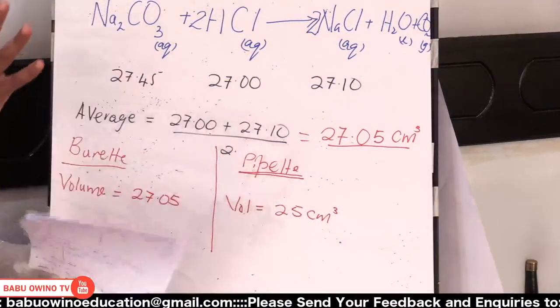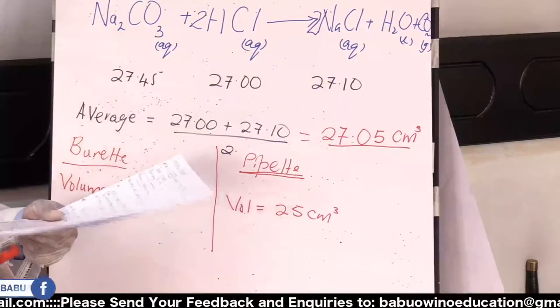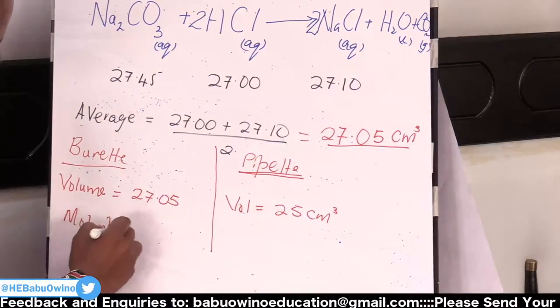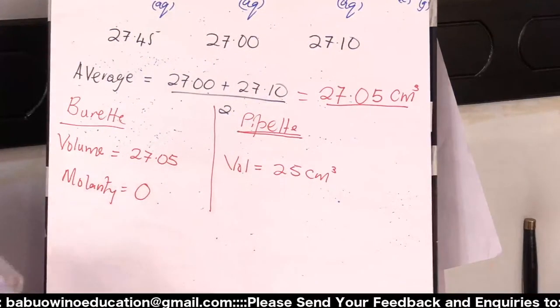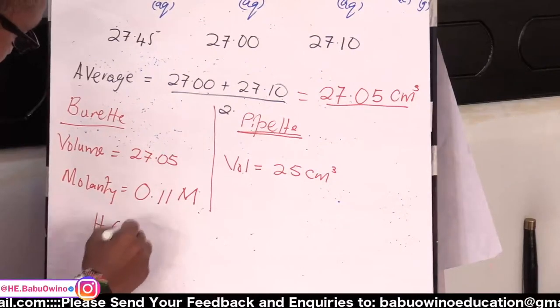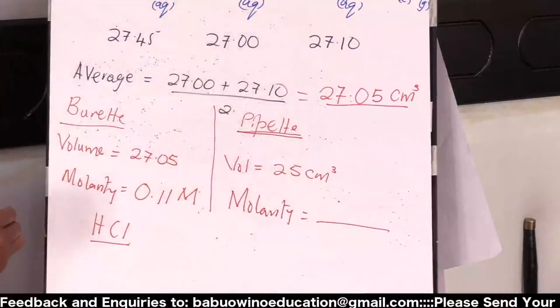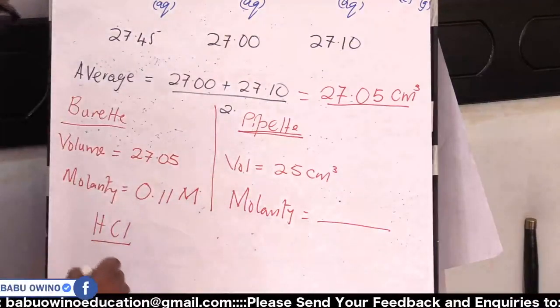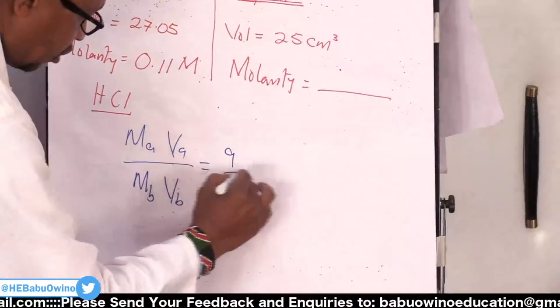Now, this is your practical is over. What is remaining now is the mathematics and the question the examiner will ask you. For instance, in this case, if we knew the molarity here, let's say, in my case, was given as 0.11 molar for the acid. This was HCl. So the molarity here is what we don't have. Remember previously, we worked out this one in different ways. And one of them was MAVA over MBVB giving us A over B.